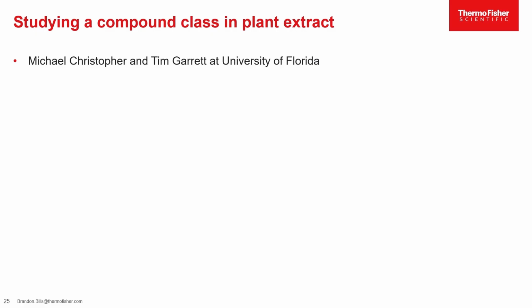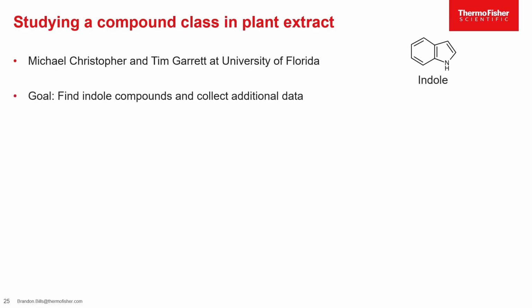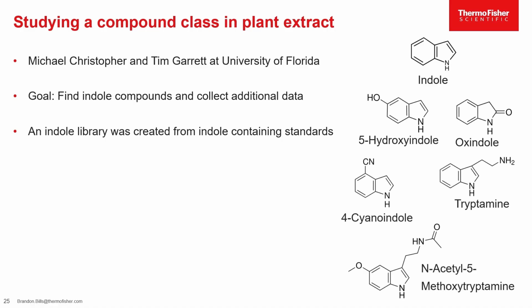This brings us to our collaboration with Michael Christopher and Tim Garrett at the University of Florida. They wanted to collect additional data on indole compounds whenever they were found in their sample, which was a plant extract. This started when they provided us a library of indole-containing standards. This included biologically relevant compounds like tryptamine and N-acetyl 5-methoxytryptamine, better known as melatonin.